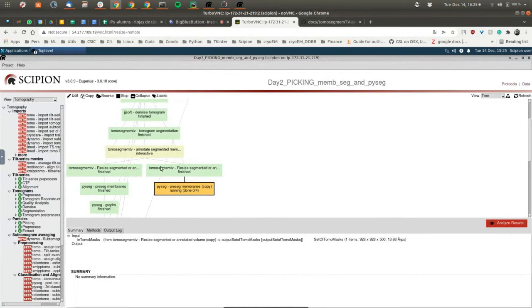Okay, so for the ones who have had to copy from here, copy the resize segmentation, execute it, and continue from there, copying the membrane and referring to it. And if anything goes wrong, just... yeah, thanks to you, Tamara. Let me go back to the other project. I'll have both open, so two part 2.